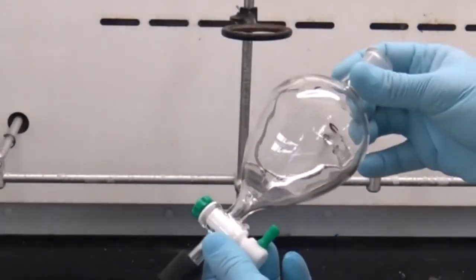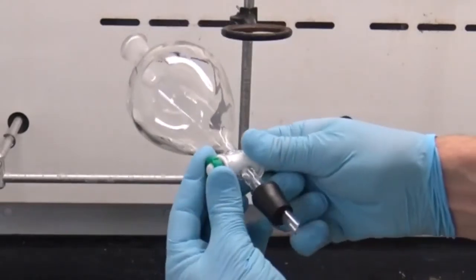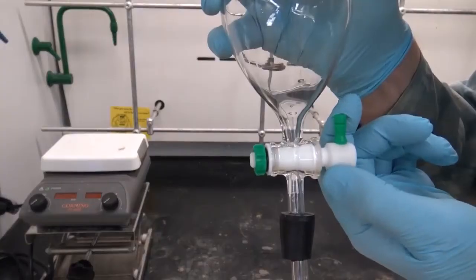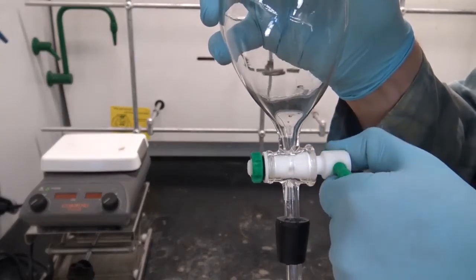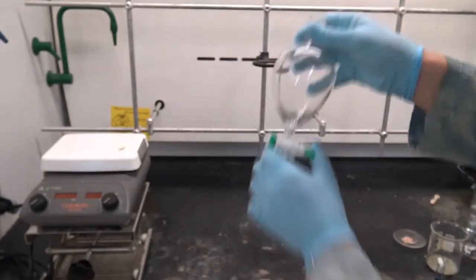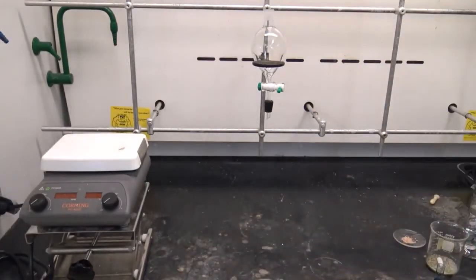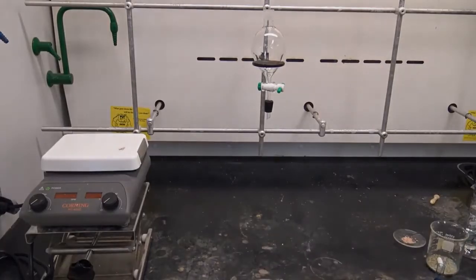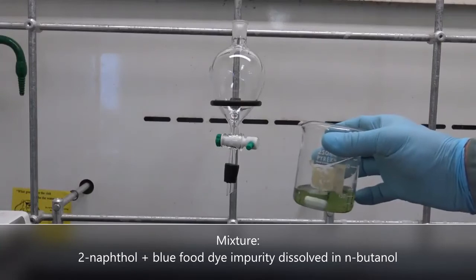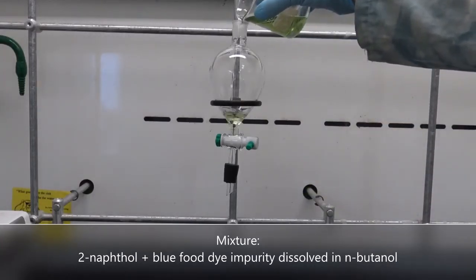Now let's have a closer look at that separatory funnel. The separatory funnel has a Teflon stopcock at the base. This allows us to remove liquids by draining them out of the funnel. Notice that little opening there in the tapered portion of the stopcock. When it's pointed in there where we can see it, that means the stopcock is closed. So I'll leave it in the closed position and return it to the iron ring. I'm going to add that solution of my compound and impurity to the separatory funnel while it's resting inside of the iron ring.